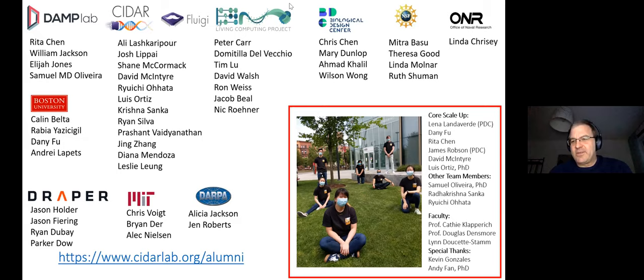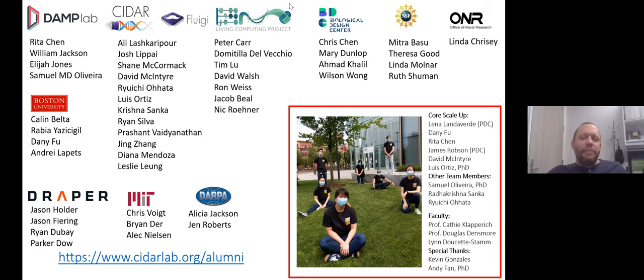So I have been fortunate that I'm involved in some startups. For example, there are aspects of this automation technology and process in a company called Asimov. That's a mammalian biologic company that Chris Voigt and I spun out with Alec Nielsen and Raja Srinivas. The way this pipeline works will start to make its way into that company. But that company is not going to expose it like a Transcriptic or an Emerald Cloud so that someone else can use it. So I think internally, it's like foundry techniques in a box. Now, individual labs spin this up internally.